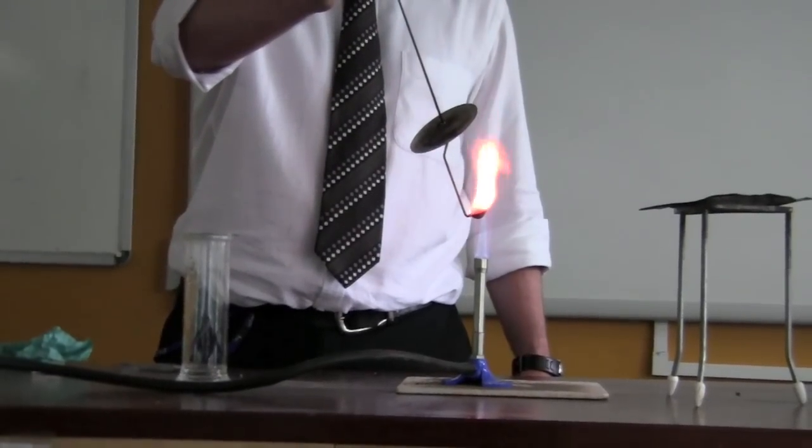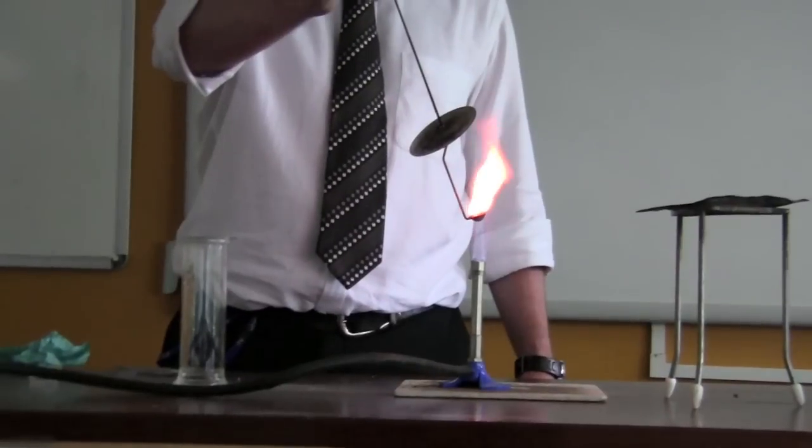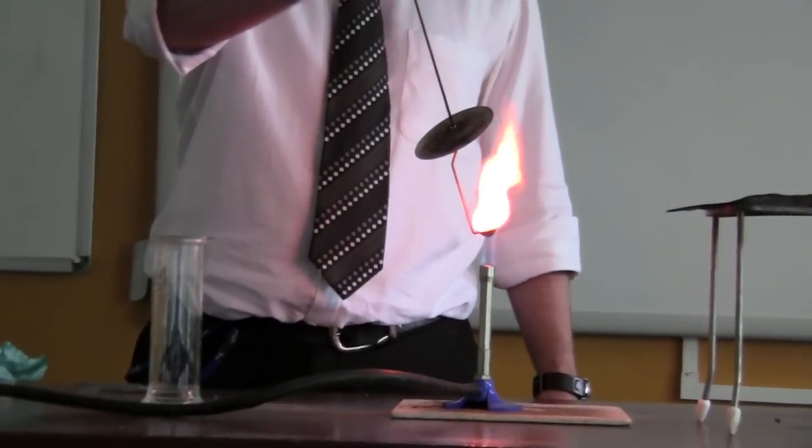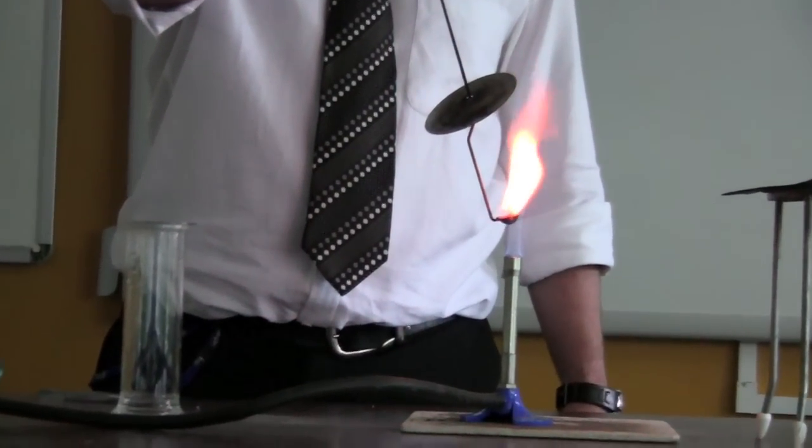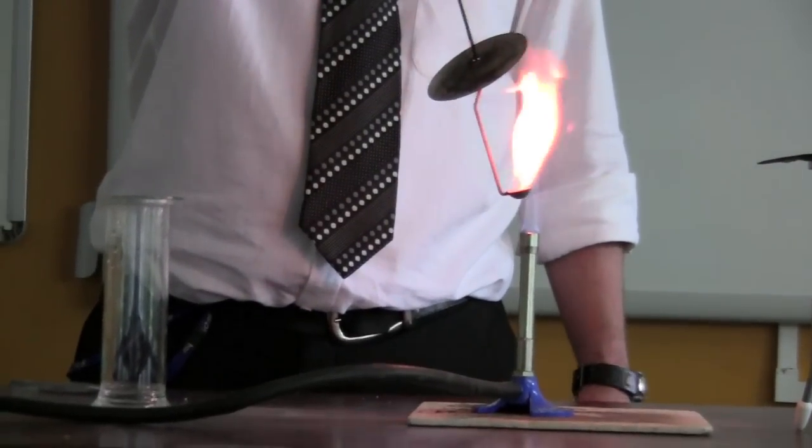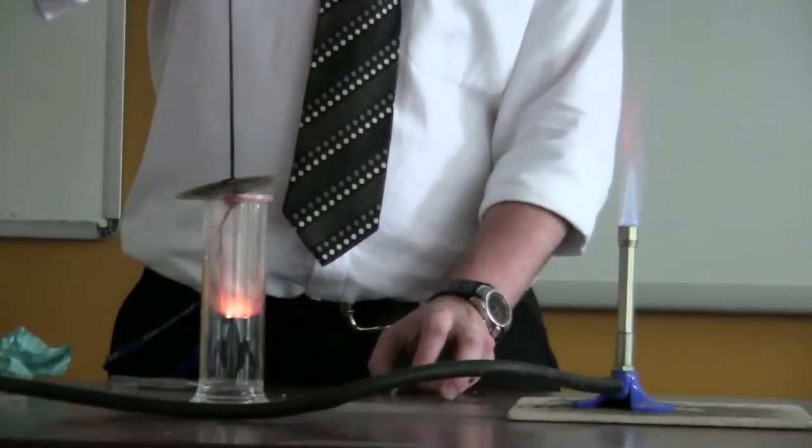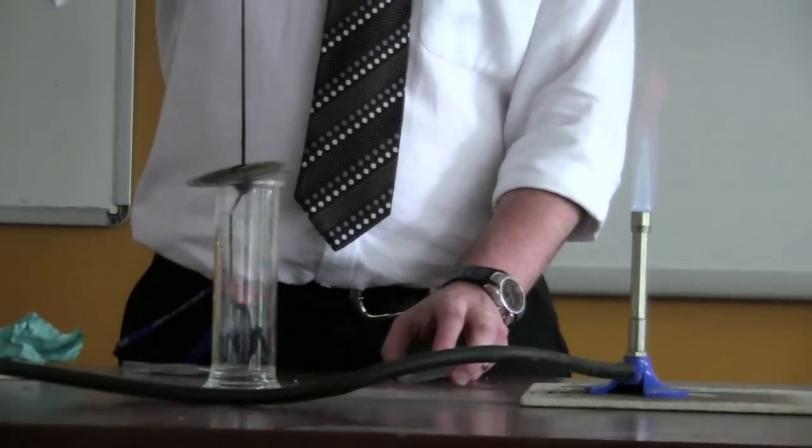Heat the sodium on the spoon. If you're as close as me, you can see it starting to melt. It's getting very hot. It's only a small piece. Put it in the oxygen.